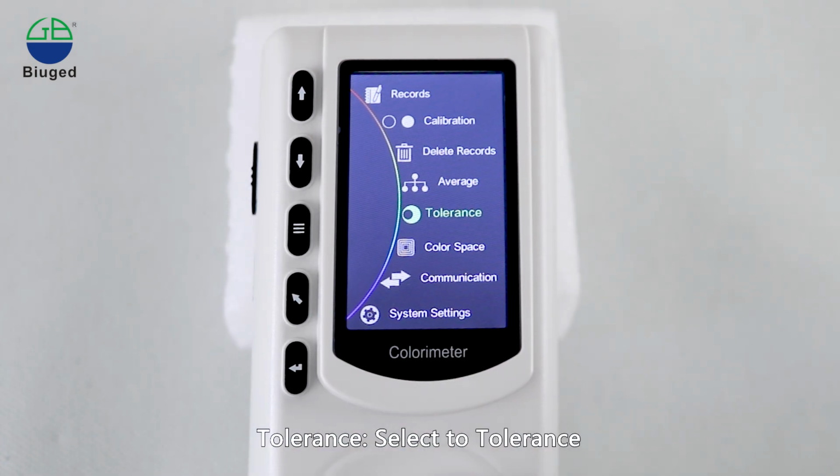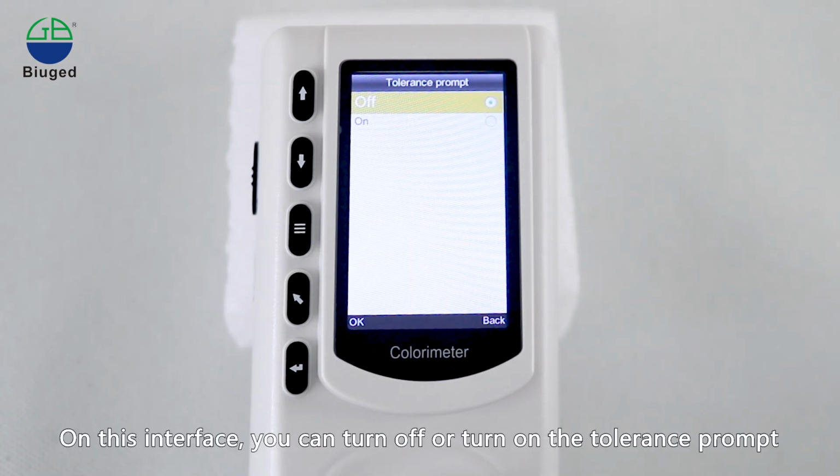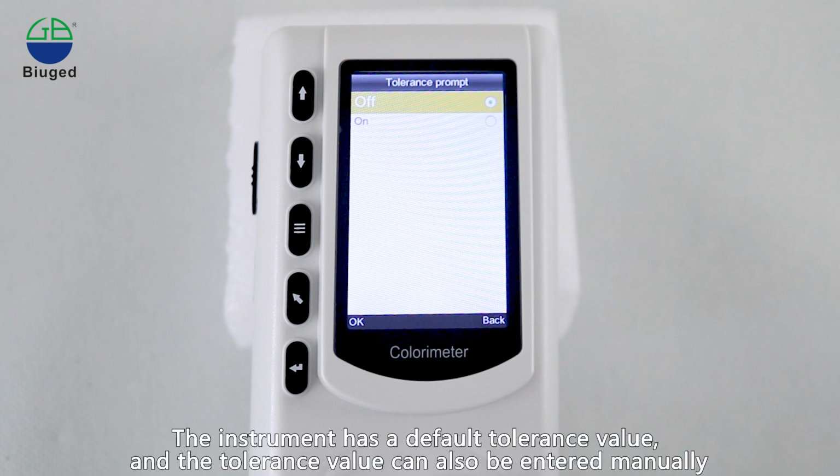Tolerance, select Tolerance. Click the Enter button to go into the Tolerance interface. On this interface, you can turn the tolerance prompt off or on. The instrument has a default tolerance value, and the tolerance value can also be entered manually.